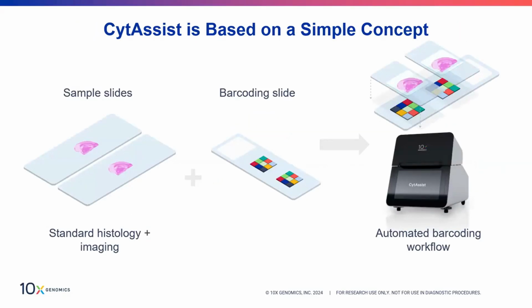Beyond the staining and imaging, we go to the molecular part of the workflow. The sections undergo an overnight hybridization of the probes that I showed you earlier, that are subsequently ligated after this overnight hybridization is finished. Only after ligation, we move on to the barcoding slide. That's basically a representation you can see here in the middle. I think the image on the top right shows pretty nicely how the orientation of your 2 original slides shows up on the actual Visium slide.